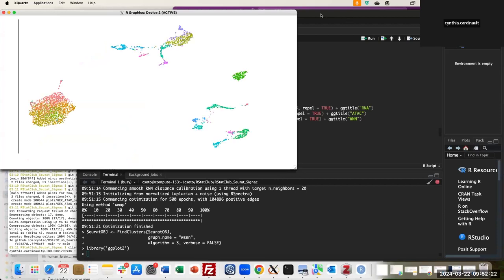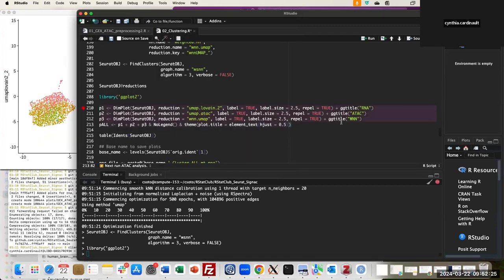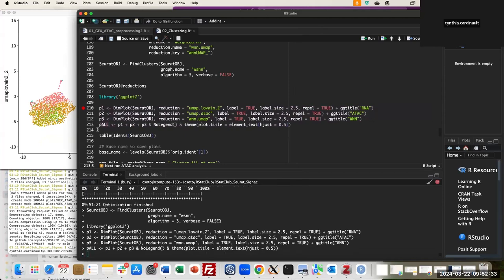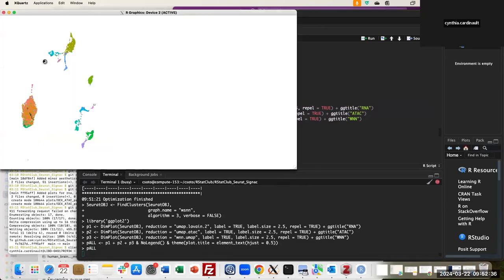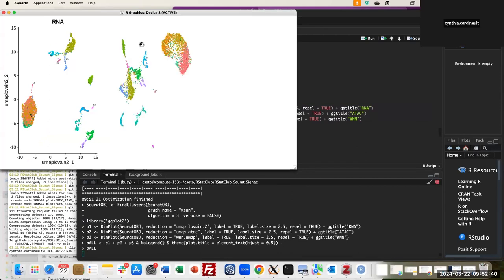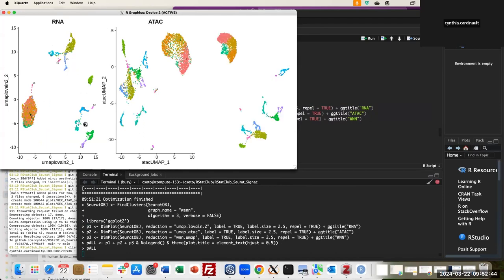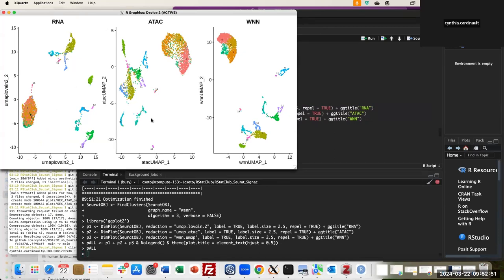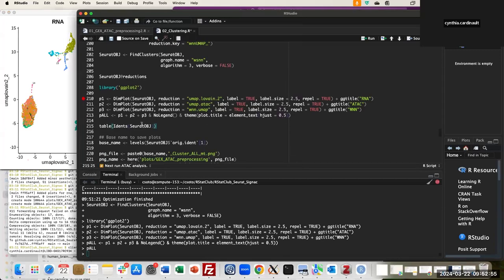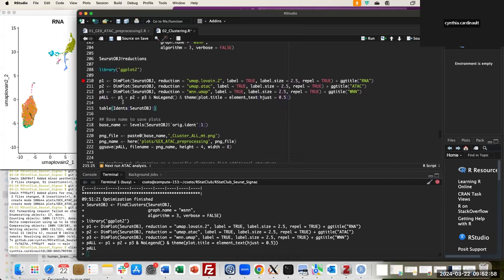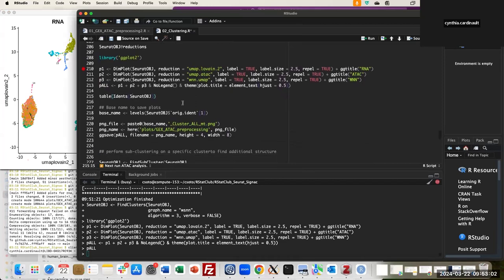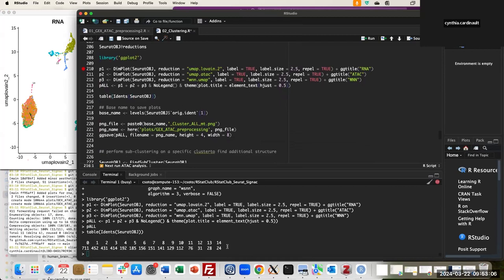Now we can look at the combined results: the clustering for RNA, clustering for ATAC, and the weighted nearest neighbor network — the combination of these two approaches. All information is saved in the corresponding slot for each assay. The result shows 15 clusters with different cell assignments.